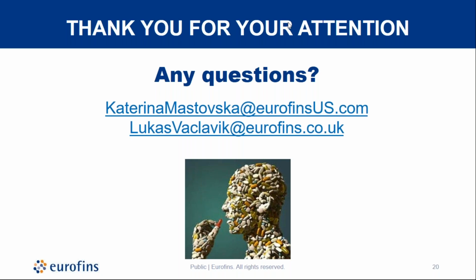Wonderful. Thank you, Kate. And I think we have time for one more question here. Considering the complexity of dietary supplements and botanical ingredients, how do you cope with quantification? There may be strong matrix effects that affect analyte signals, and quantification with solvent standards may not always be available or possible.